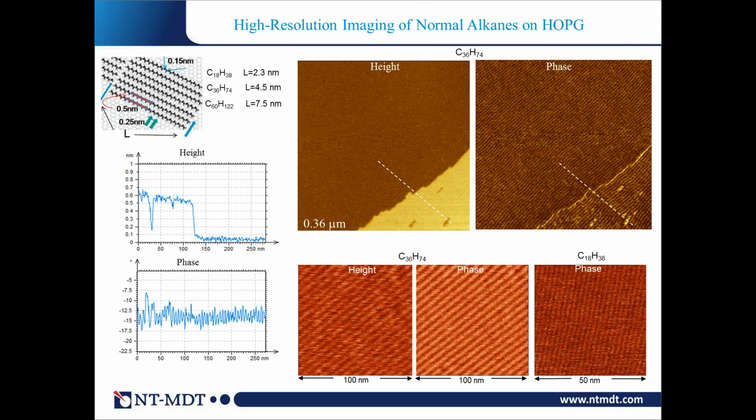These samples can be easily prepared from alkanes of different lengths, and they form lamellar structures which lie flat on the surface, and the distance between them is consistent with the length of the chain. Plus, you know that all scanners need to be calibrated, and calibration is a tedious but necessary part of the experiments, because you want to get right numbers from your measurements.